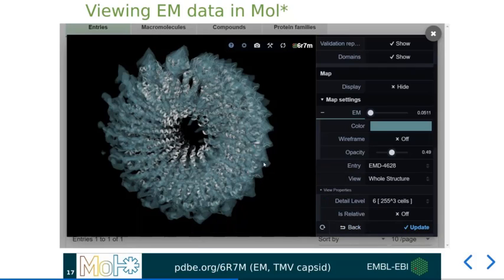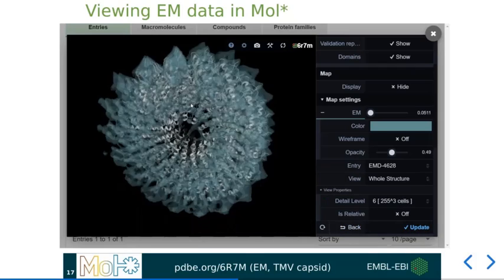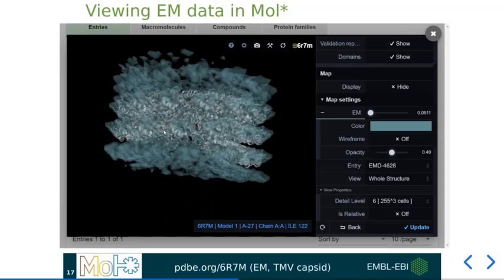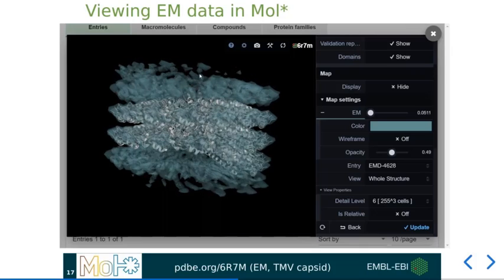Now at this level, we can clearly make out, especially if I turn the structure this way and zoom in again, the additional volume for which the depositor did not continue to build structure.